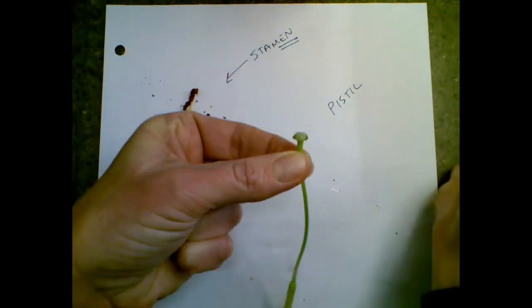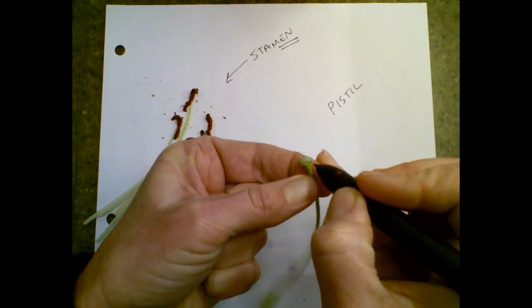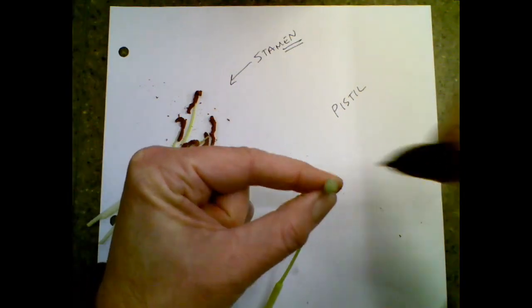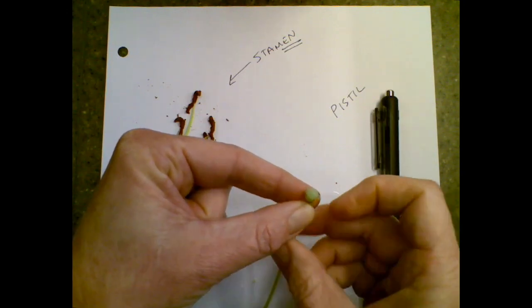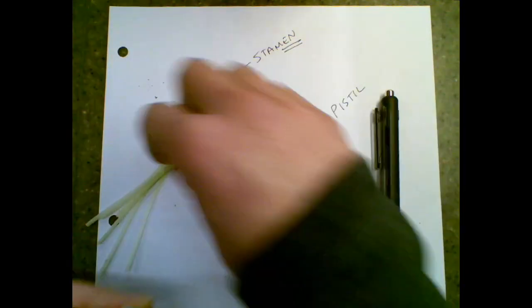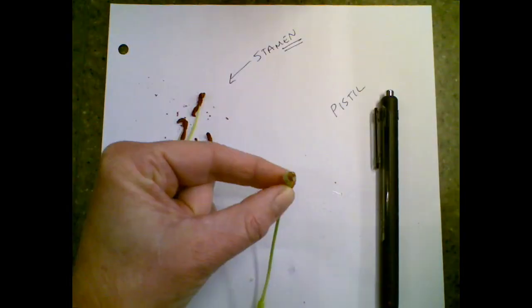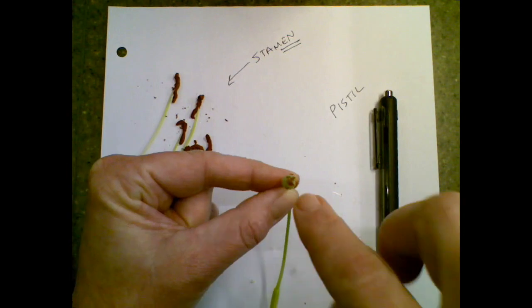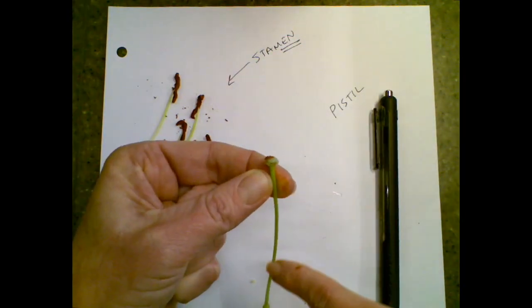So when I look at it, there's like a little lobe here, a little lobe here, and a little lobe here. So it is a multiple of 3, and there is a hole right there. So basically, if a sperm gets here, I'll do it. This is like rated R. There. If a sperm gets on this sticky stigma, it'll travel through that hole, down this, there's a tube in here. This is called a style.